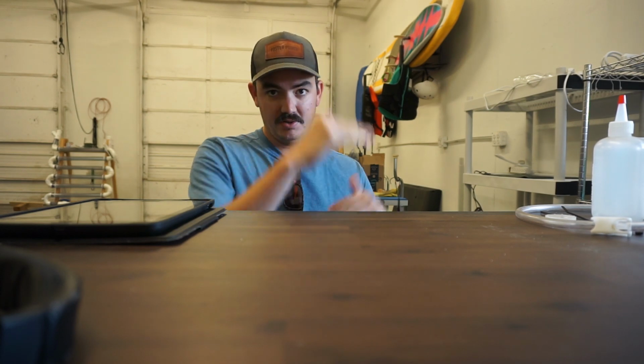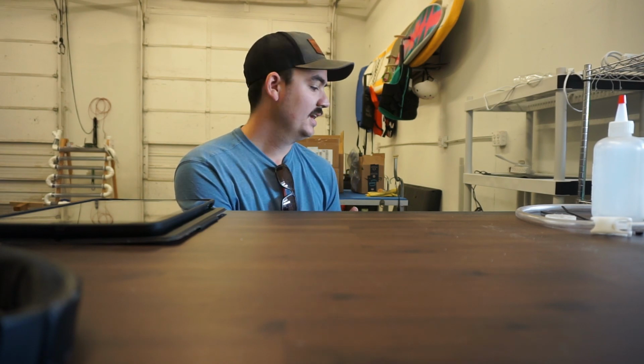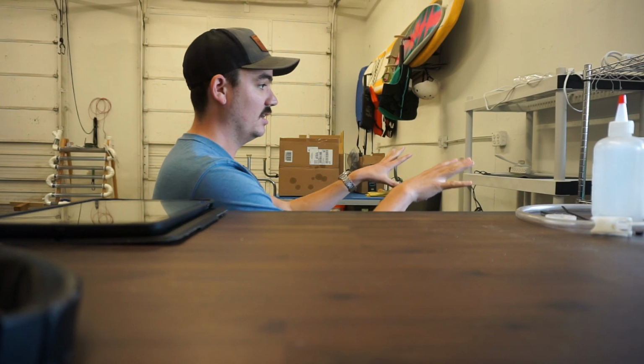So I'm just going to run through real quick and take out what we ordered and show you guys all that stuff, because there is a little bit of a process before we can put the algae in the bioreactor, which is over there in the corner. You gotta grow it up, starting small in little flasks and progressively moving it on up to get it ready to go in there, so it's not just flushing through regular water and not growing that way. So I'm gonna show you what we got here, and then show you how I'm gonna be setting it up on the shelves as the starting process to progressively move from small to big.